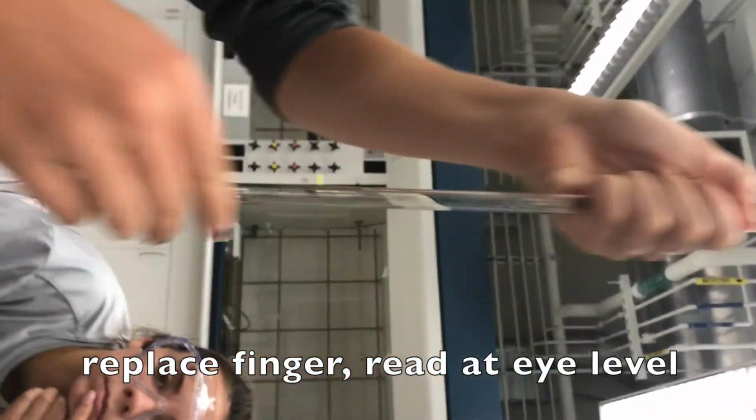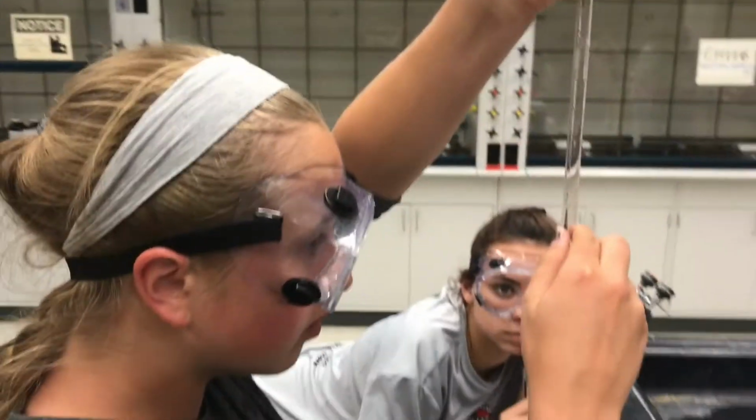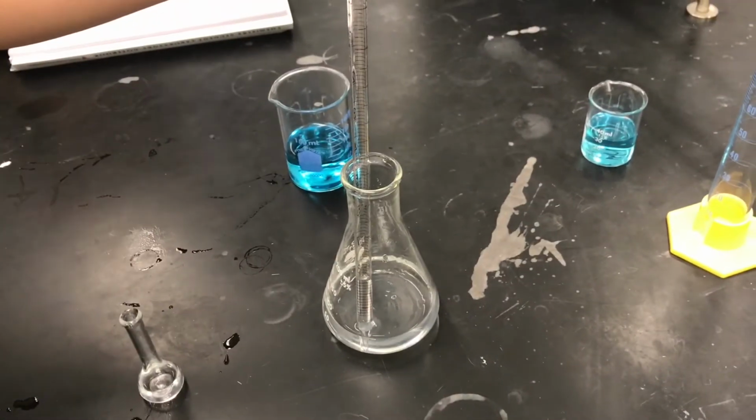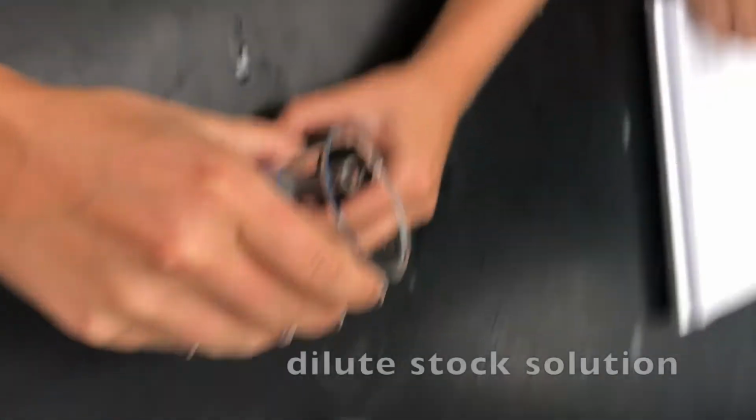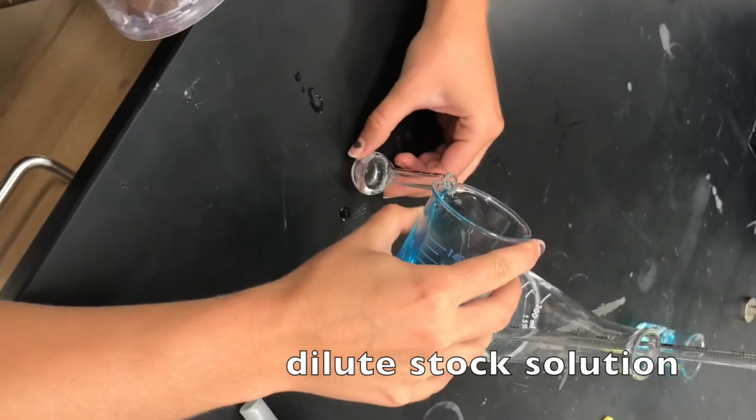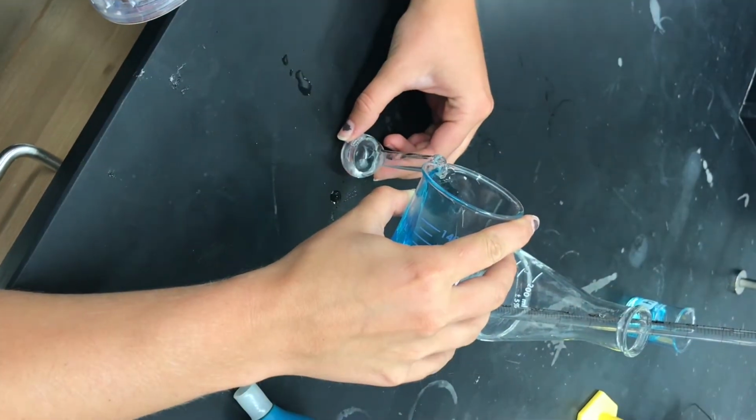Replace your finger and record the new volume. Use these measurements to determine the final volume. Then, add water to the volumetric flask to dilute the stock solution.